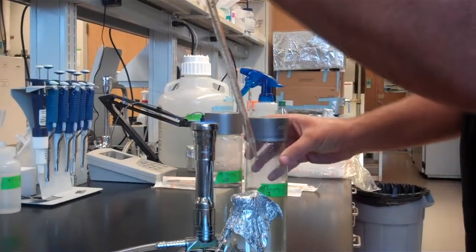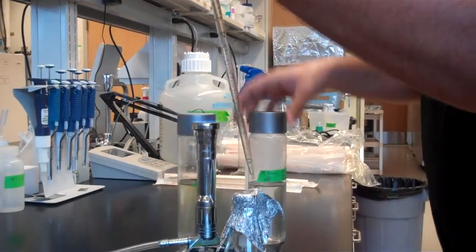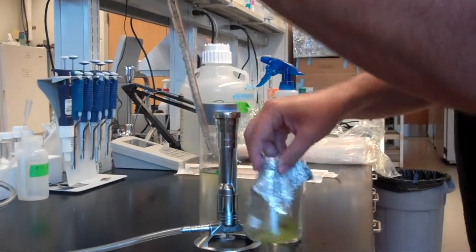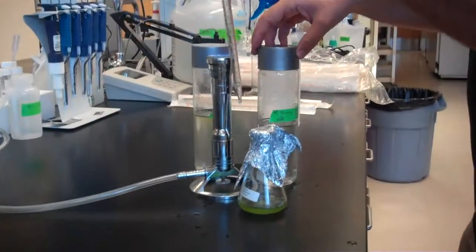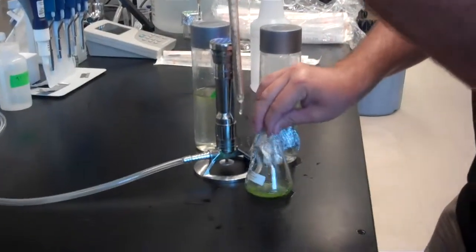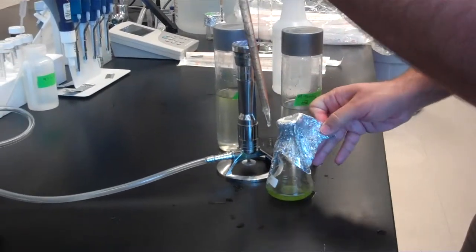I'm going to close that and then move it out of the way a little bit, bring the other one forward. Going to resuspend my algae. Make sure that's loose. I always have trouble getting this off.